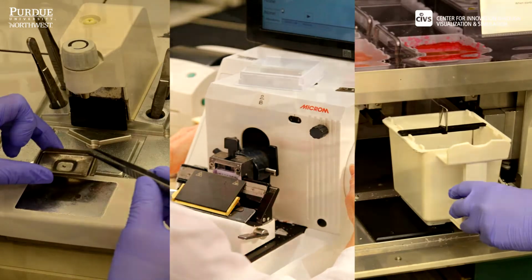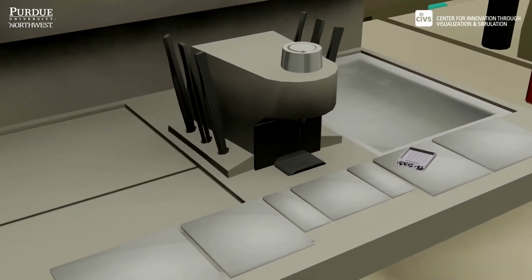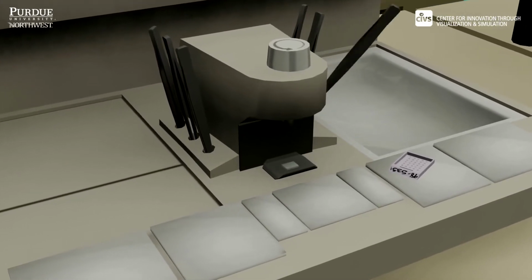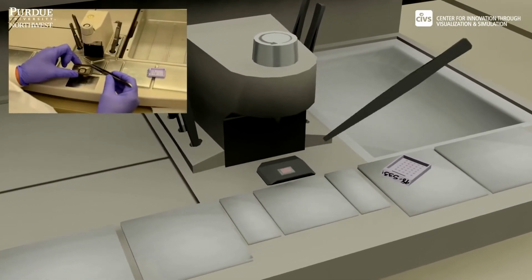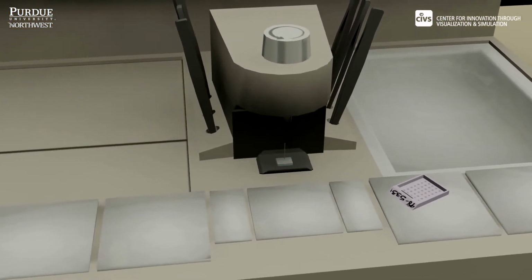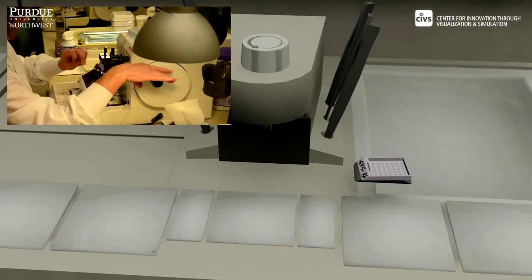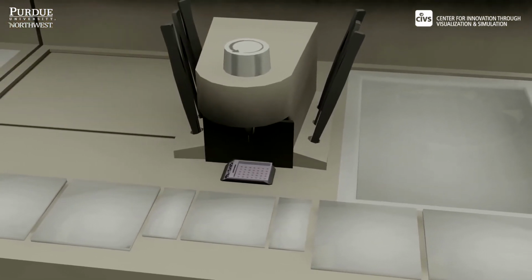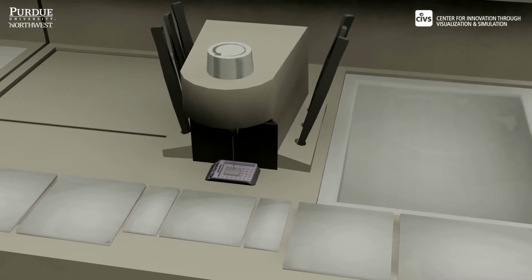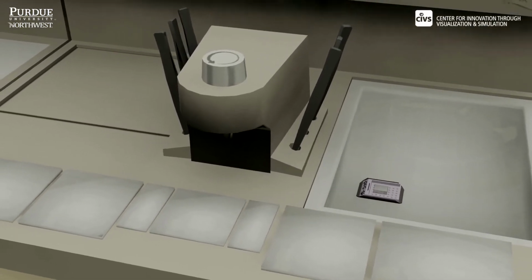processing. Processing tissue samples consists of putting the samples through several changes of different types of reagents in order to ready the tissue for embedding, sectioning, and slide preparation. Embedding the tissue refers to orientating the biopsy into a paraffin wax in such a way to allow the structures of the tissue sample to be sectioned by the histotechnician from a paraffin block.